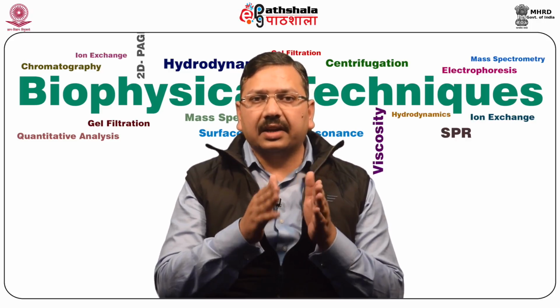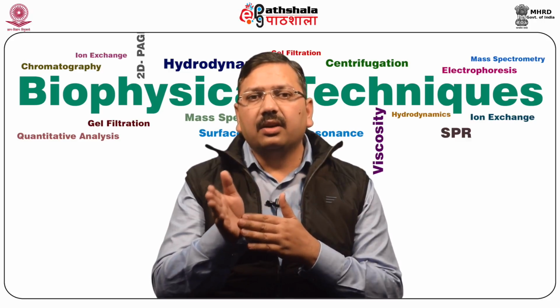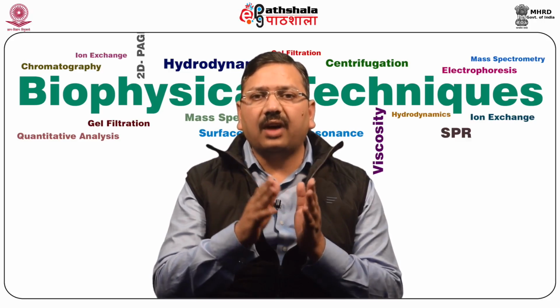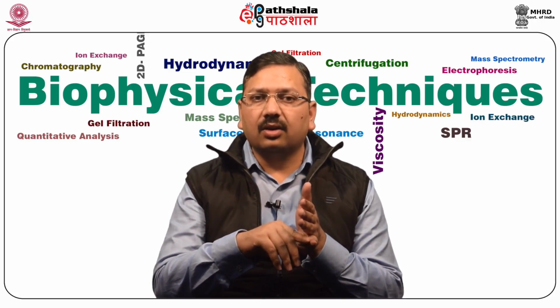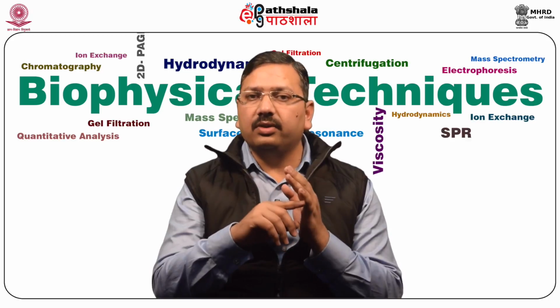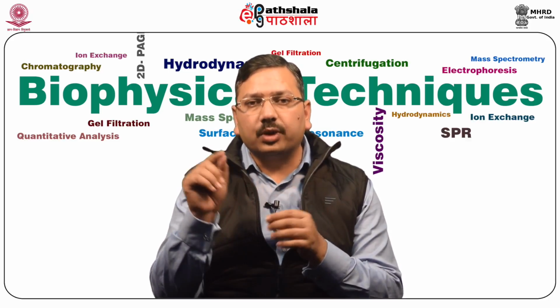It shows the direct characterization of a sample's proteins in a mixture of proteins and gives the answer to the following questions: what proteins are present, what isoform of each protein is present, and lastly, how much of each protein is present.